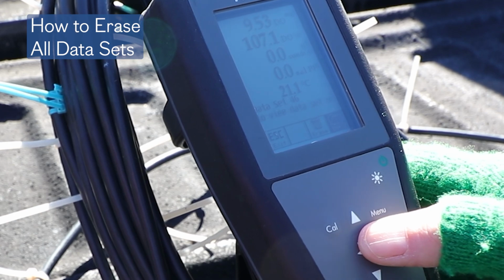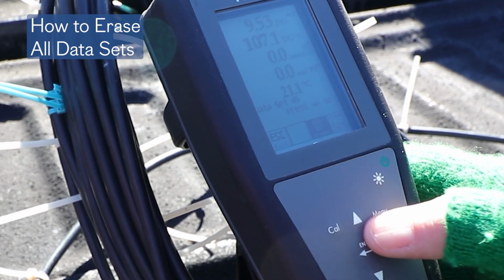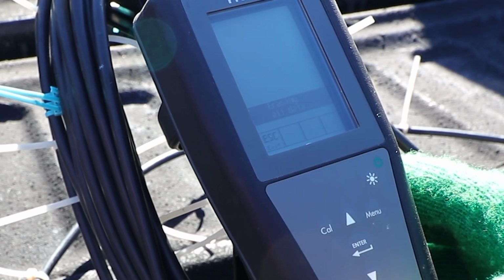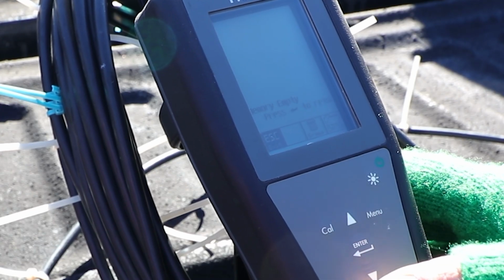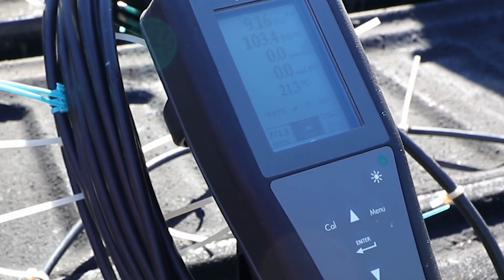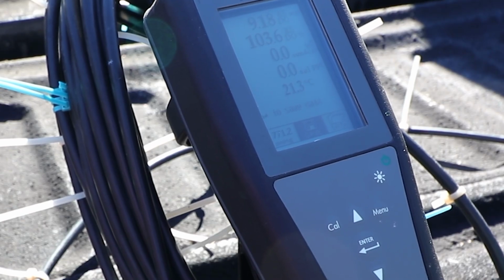If we want to delete all datasets, we press enter, up, enter. Now we're going to use the down arrow to select erase all sets. Press enter, it'll tell you it's erasing all data, and then you should see memory empty. Press enter to return to the main screen. You now have 50 more data sets that you can save to your DO meter.